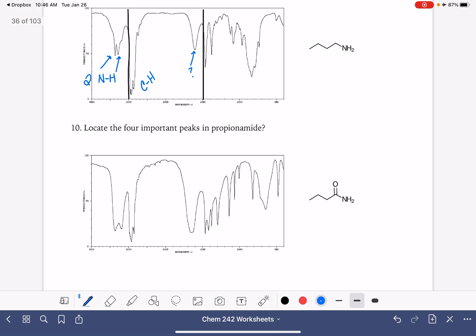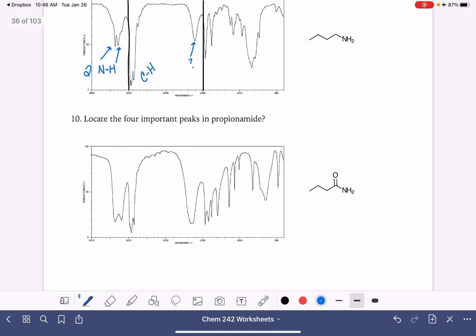And then last but not least, the four important peaks in this molecule. Let's draw our lines, 1500 and 3000. We've got our carbon oxygen double bond, very broad and very strong. We have our standard CH peaks, and then we have our two NH peaks right there.